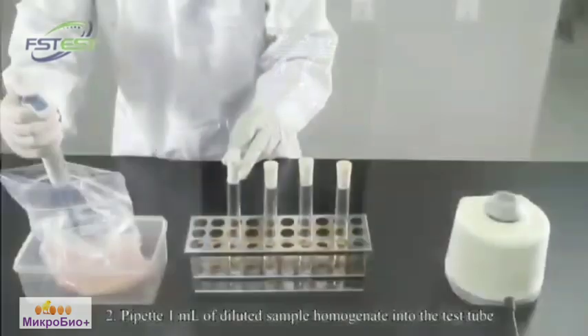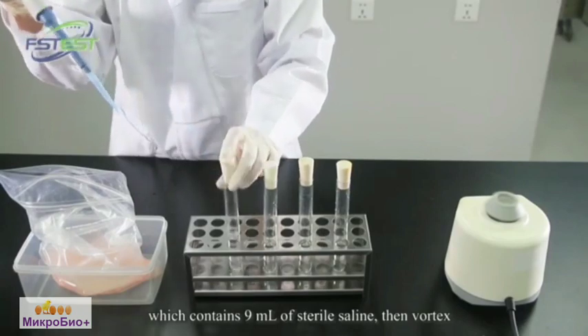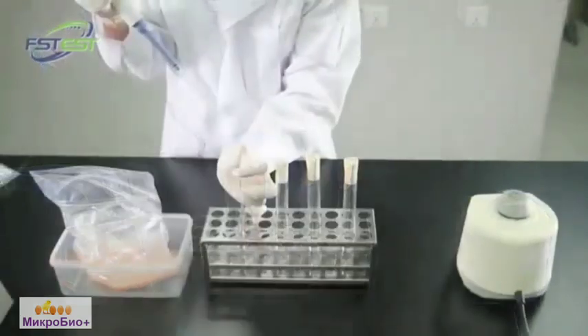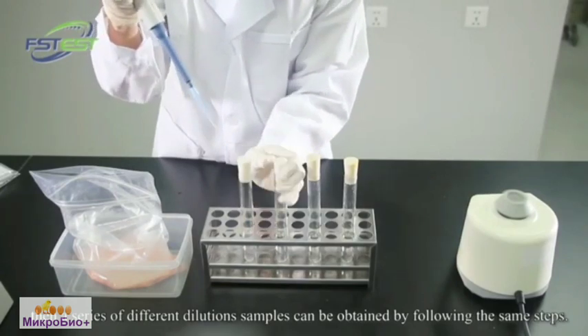Pipet 1 milliliter of diluted sample homogenate into a test tube which contains 9 milliliters of styro-saline, then vortex. The sample solution with a ratio of 1 to 100 is prepared. Replace the used pipet tips for each gradient, then a series of different dilution samples can be obtained by following the same steps.